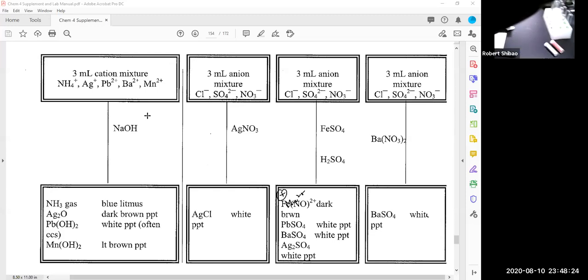figure. So I got some test tubes here, and we've got to label the test tubes. I've got my Sharpie here for labeling the test tubes. Okay, for the first one, for the ammonium, I want to do it in a small beaker. That'll be easier. What's the smallest beaker I have? My small beaker is dirty, so I'm going to use a 150 milliliter beaker for this.